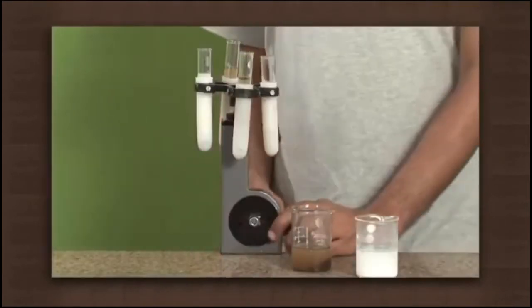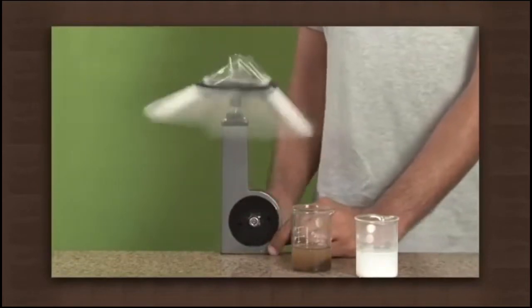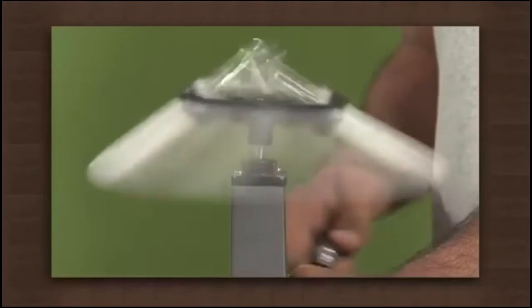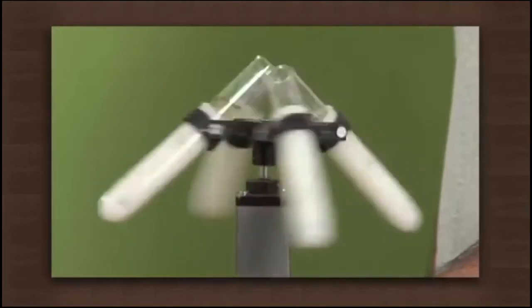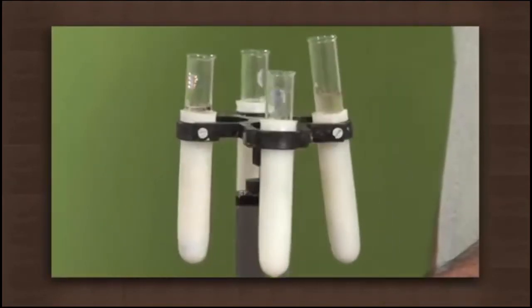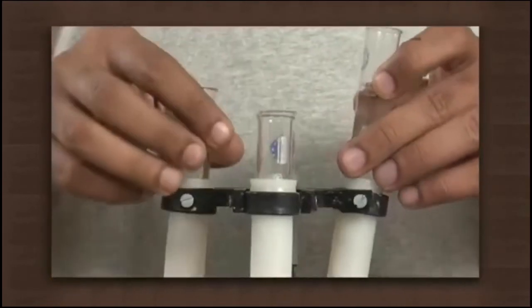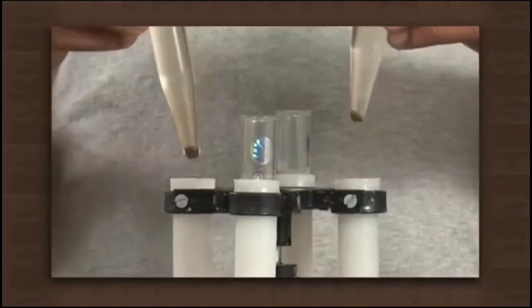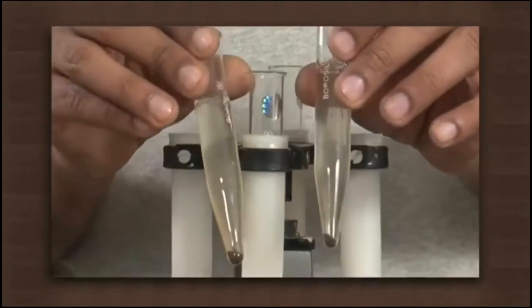Rotate the machine fast for a few minutes. Stop rotating. Remove the test tubes and observe. We see mud particles and white precipitate have settled in each of the test tubes.